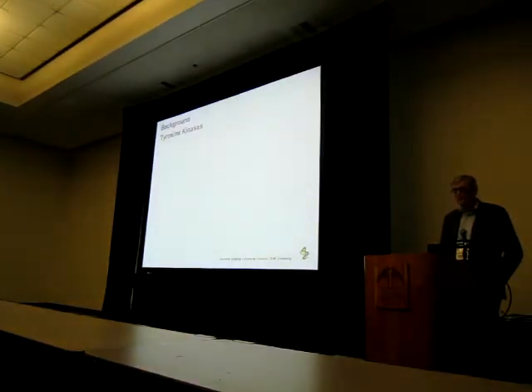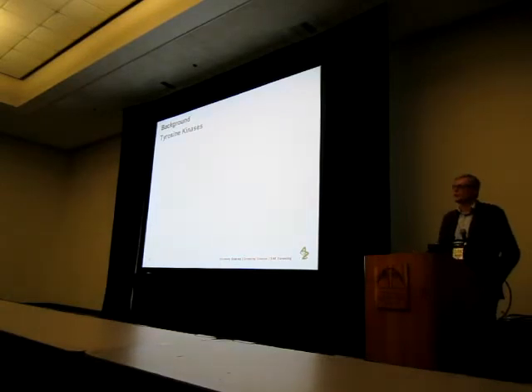So the assay I'm going to talk about today was some work we did on a tyrosine kinase. Now, where I work at Alderley Park, we have a very large oncology group, and for obvious reasons, oncology have been involved with kinase screening for quite some time. So over the last 10 years that I've been at AstraZeneca, I've done an awful lot of kinase screening.